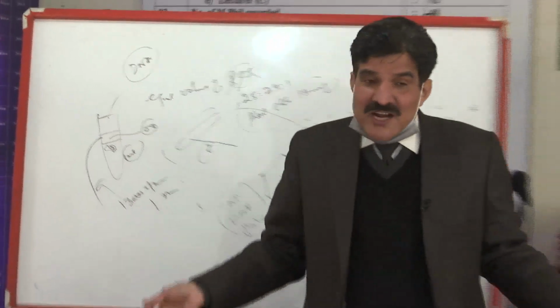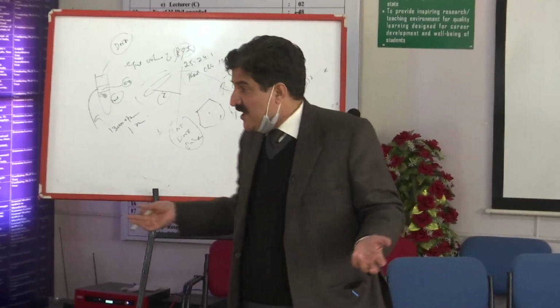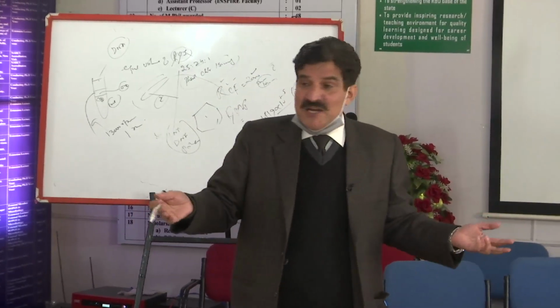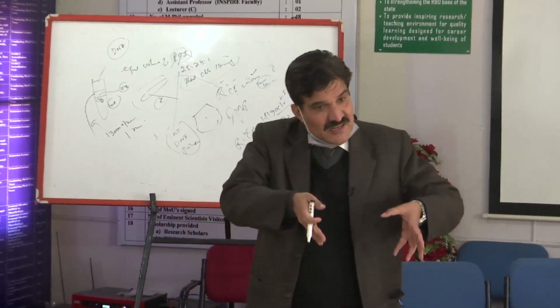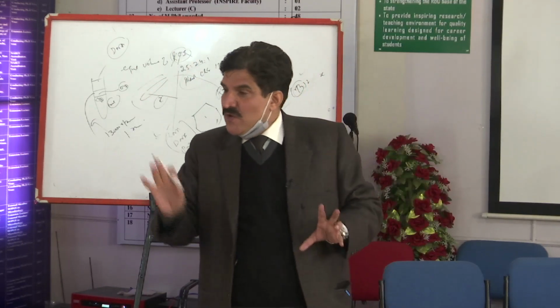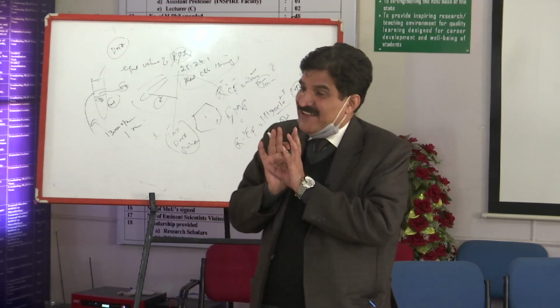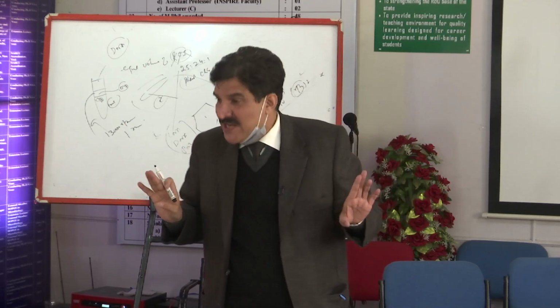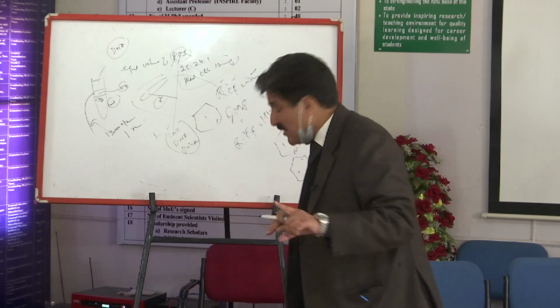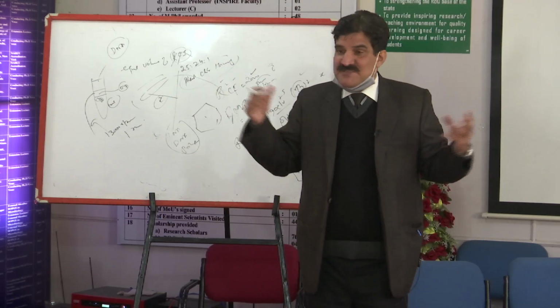Now DNA is also containing a lot of polar molecules associated. They can still interfere. But from such a huge number of molecules, we now have only DNA. Up to here, RNA and protein have been somewhat removed. But in one go, you cannot achieve 100% purification as you are expecting.